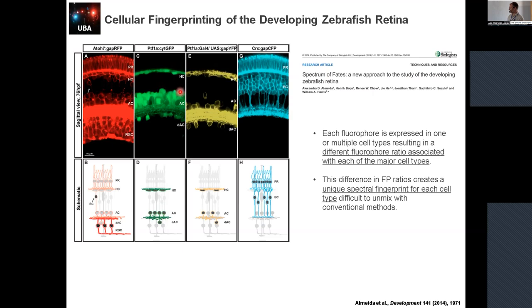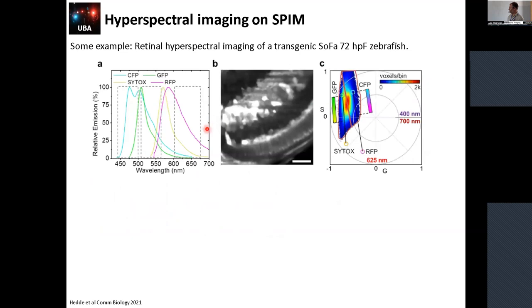Basically, what we did is take an image and obtain the spectra through the sine cosine filter. You can see that the overlapping of the fluorescent markers is very, very high, which really compromises the possibility of splitting by channels. And to complicate our life, we also put an extra marker, which is a marker for the nucleus.